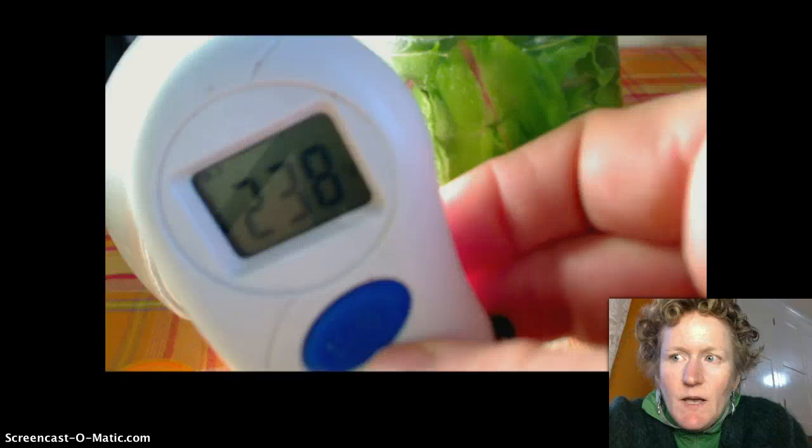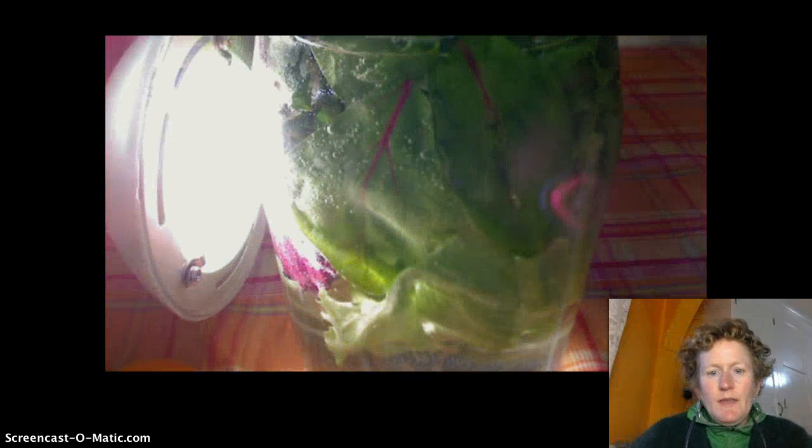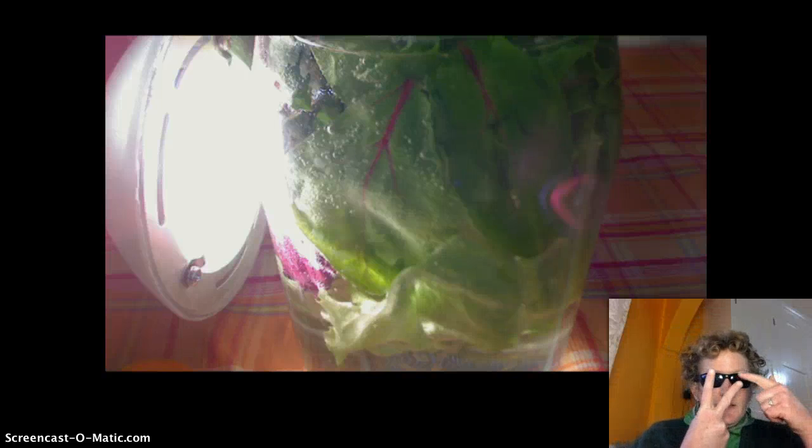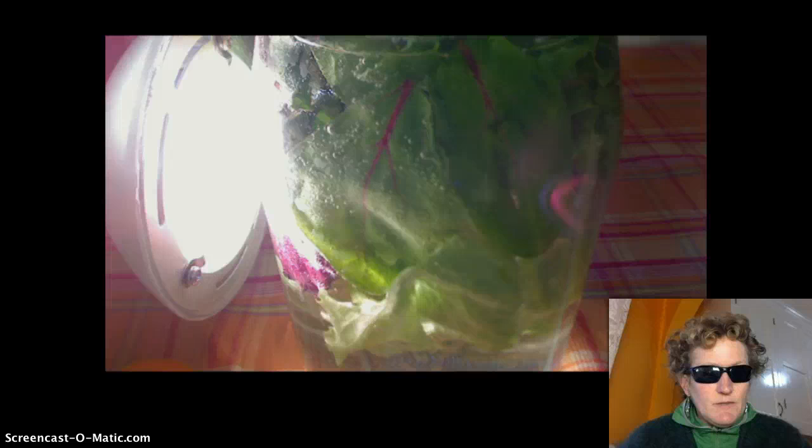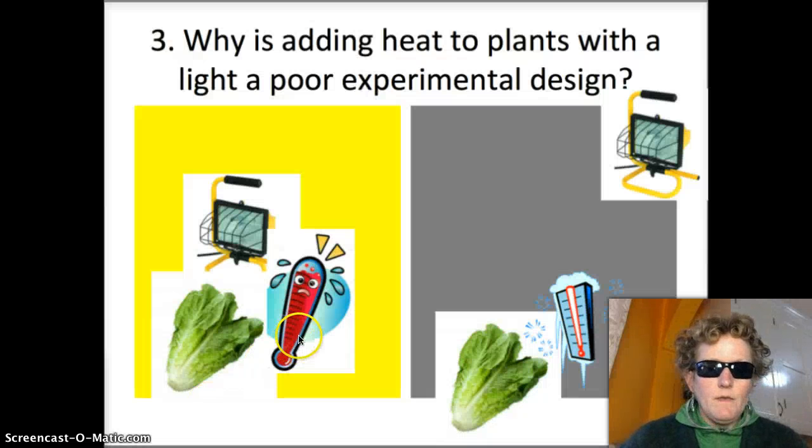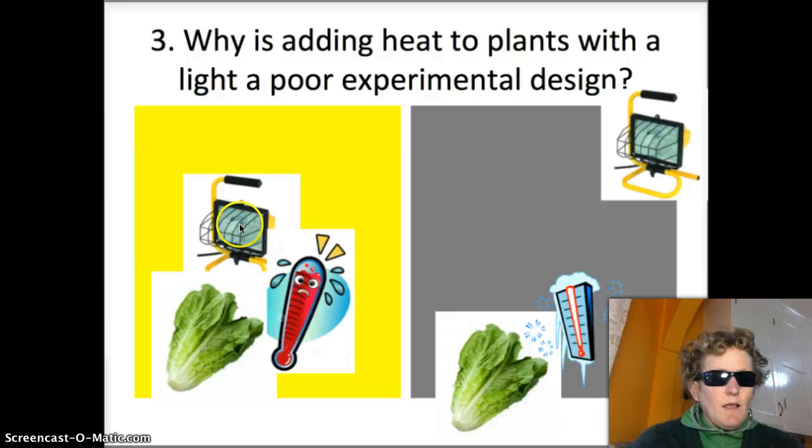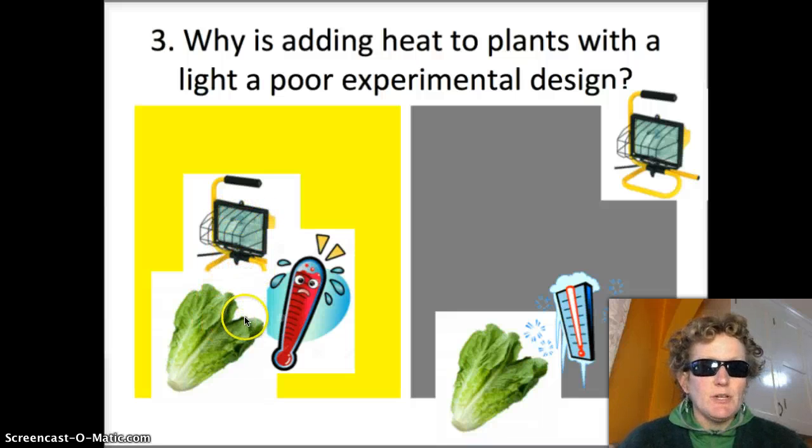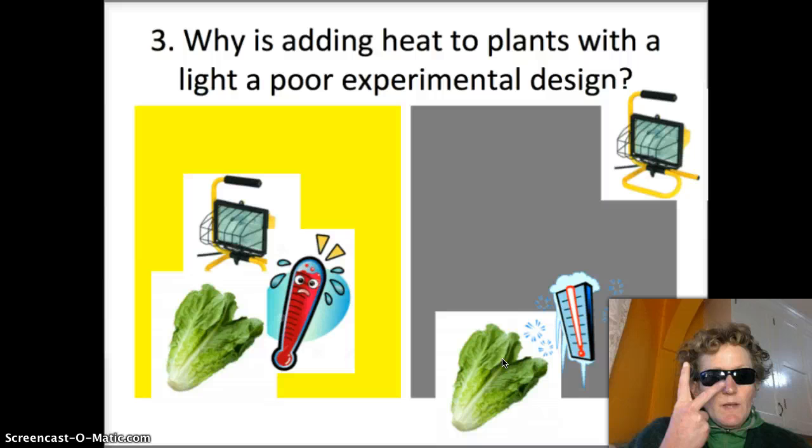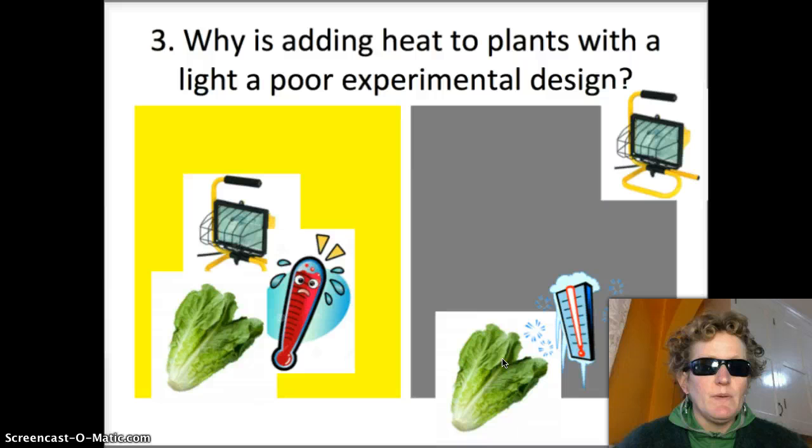So when we use a light close to a jar like that we get two variables that affect the rate of photosynthesis. We get light and heat and that's what we're going to talk about in question three. When we set the light close here to the lettuce it gets really hot. We get high light intensity and we also get a high temperature. When we put the light far away the lettuce cools down and it gets less light. So in the lesson it's a poor experimental design because they're changing two variables at once.